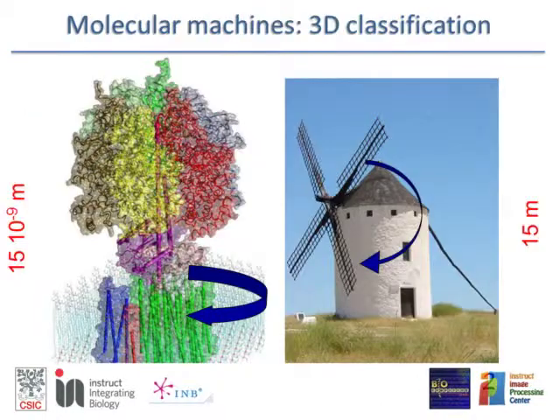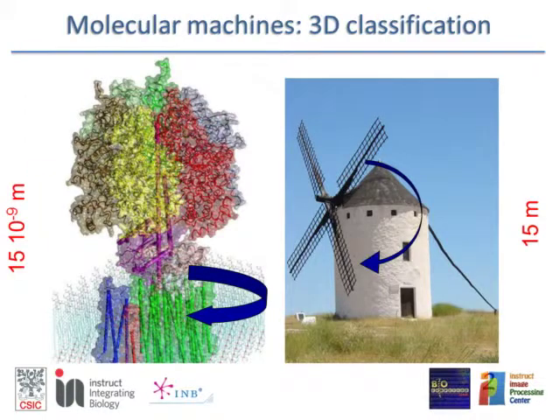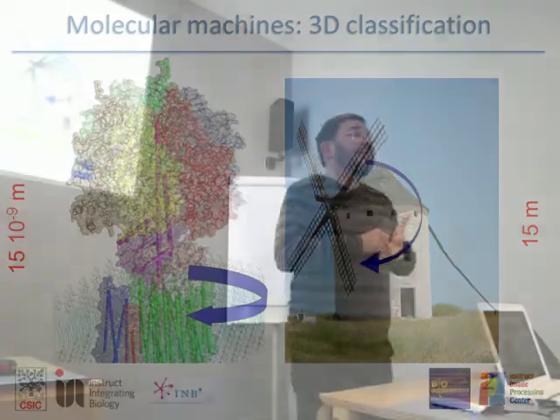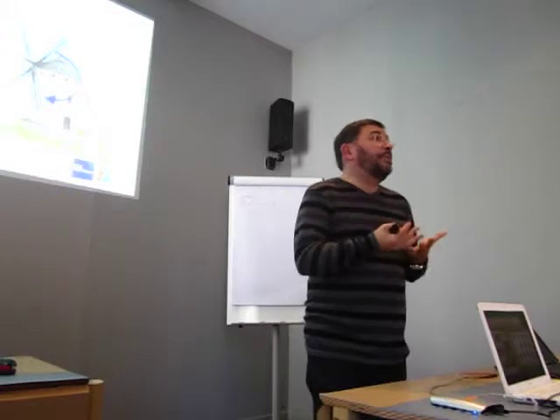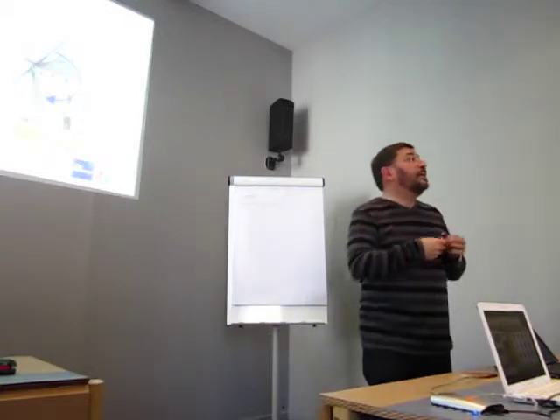Well, and of course, the classification is intrinsic. Here I'm putting a number of examples that are about conformational changes, things like that, but movement and conformational changes are the basis of function. So what you cannot expect is that a static structure is going to be telling you how function is happening. You must have a snapshot coming from whatever way you have, by that structure in complex with X ligand, whatever condition, or by analyzing huge data sets in electron microscopy.